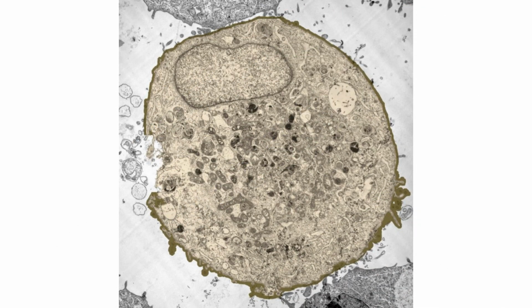Now, if we were to look at a general animal cell using a light microscope, we would be able to observe the cell's surface membrane as the boundary of the cell. Remember, the cell membrane is 7 nanometers in diameter, so it will not be seen as a separate structure. We will also be able to see the nucleus, including the nuclear membrane, nucleolus, and chromatin. We would also be able to see the Golgi body as well as the general shape of the mitochondria.